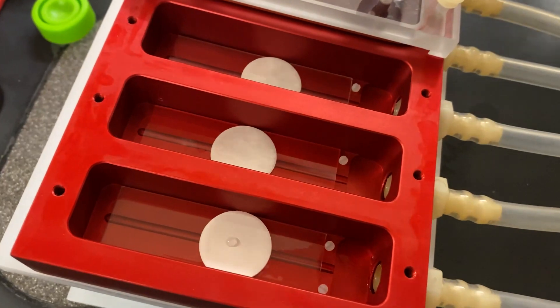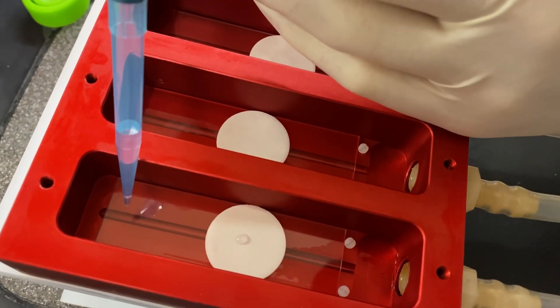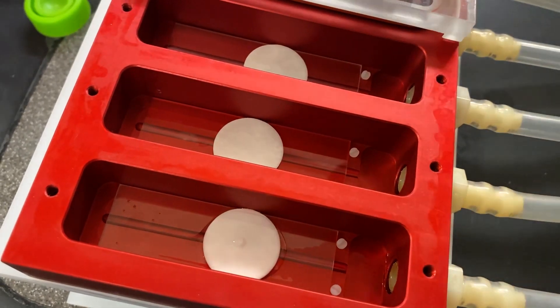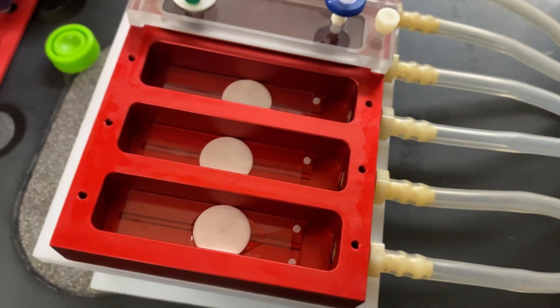While the system is running, the medium drips down the slide where it runs into the pad and is wicked upward, thereby feeding the biofilm from below.